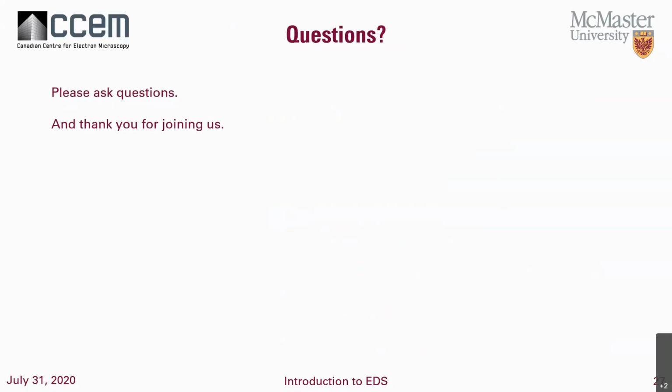I guess on a similar note, at the beginning of the lecture, you said that lithium can be detected with the right equipment and conditions. Can you please explain more? Okay, so lithium is a very low energy X-ray.